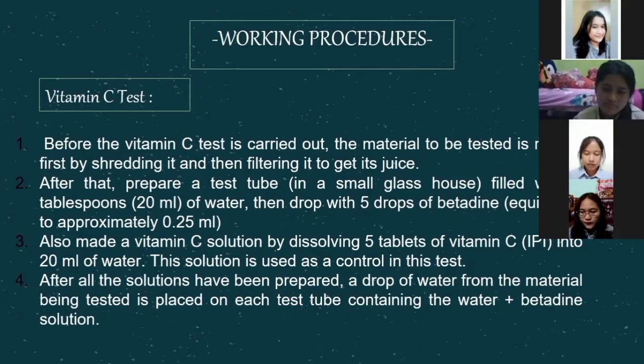4. After all the solutions have been prepared, a drop of juice from the material being tested is placed in each test tube containing the solution. Next, Adelbert will read it.